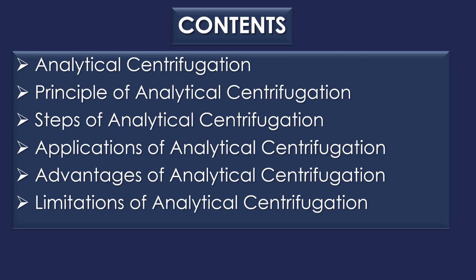The contents of this video include introduction about analytical centrifugation, principle of analytical centrifugation, steps of analytical centrifugation, applications of analytical centrifugation, advantages of analytical centrifugation, and limitations of analytical centrifugation.